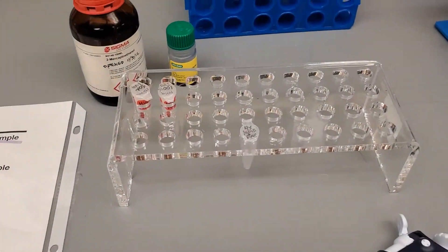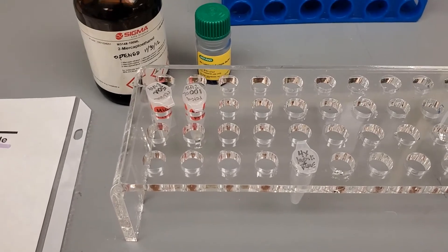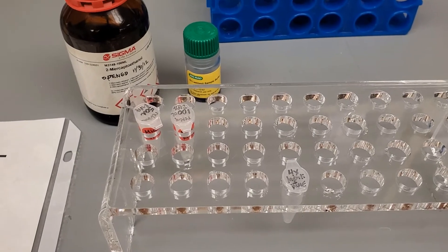In this step, I'm going to be preparing my cell lysate samples. We're going to denature them in order to run them in the SDS-PAGE gel.